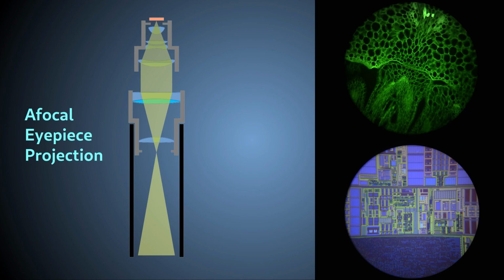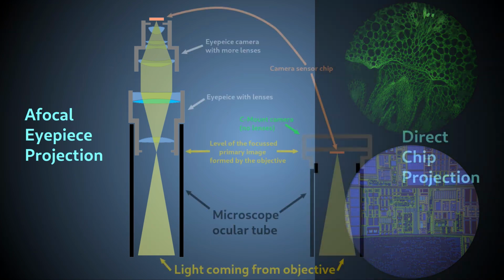The disadvantage of this method is that the image signal is attenuated due to all the glass it has to pass through, and there will be some distortions in illumination and focal planarity due to the accumulation of aberrations caused by all these lens elements. So please bear in mind that the actual image you see down the scope by eye will be significantly better than what is shown with this camera system.